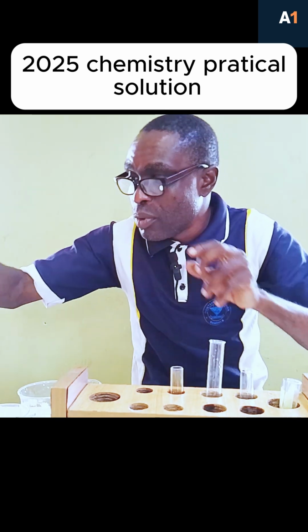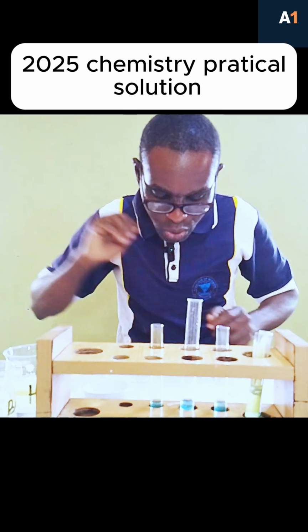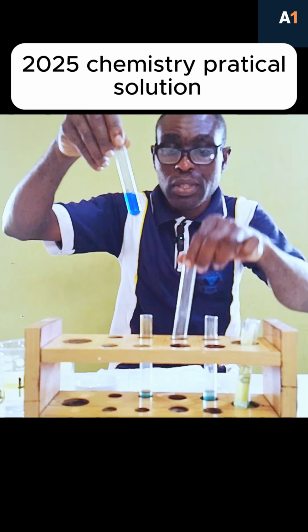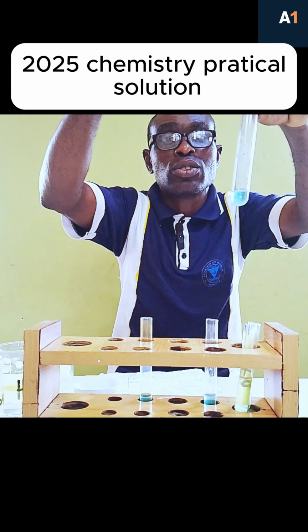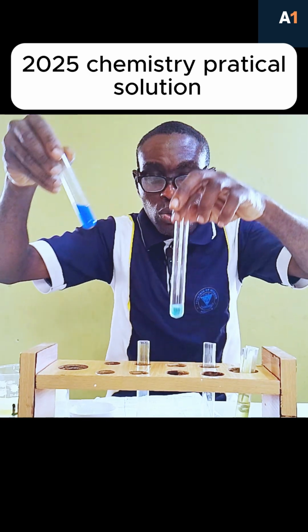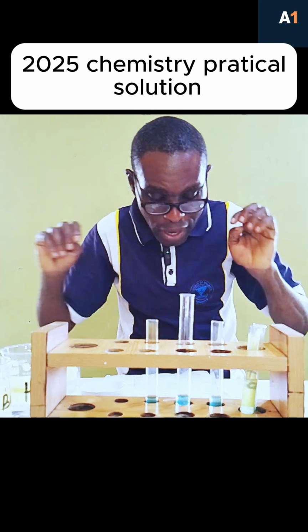So we have done that one for the first portion. So blue color but insoluble, as you can see again. Let me compare the color, you can see to show that it has turned to blue, and this one you can see some particles, which means insoluble both in drop and excess.